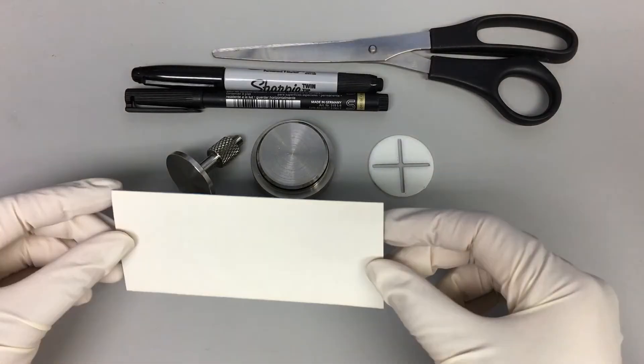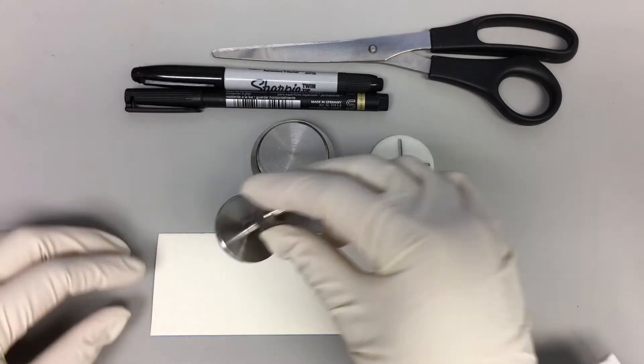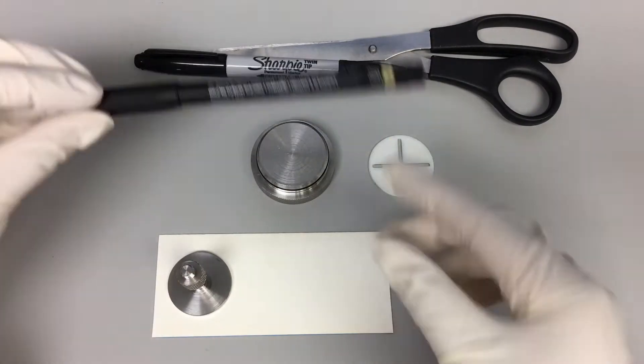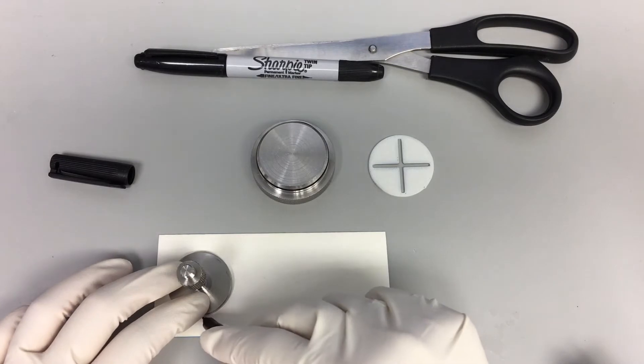Place the sandpaper on a flat surface with the back side facing upwards, position the flat indenter on this side and trace its contour using a permanent marker.